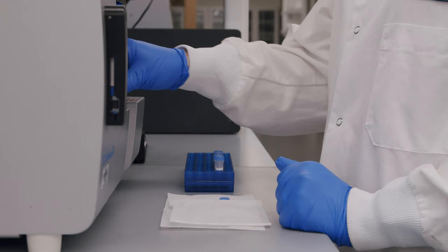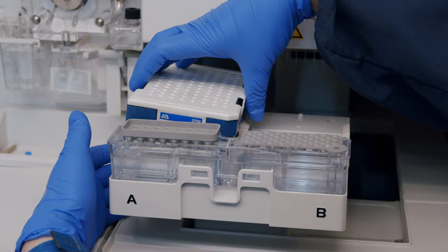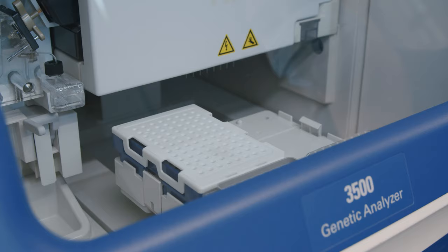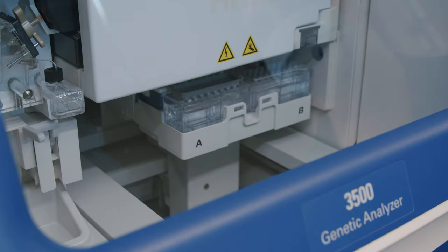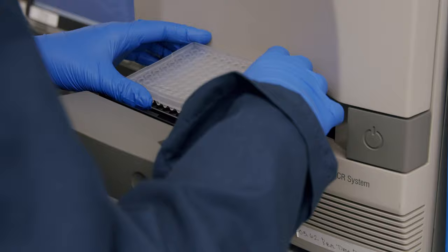After I know how much DNA is in the sample, I use additional chemicals and another instrument that works like a copy machine. It looks at the specific locations that we're interested in as forensic scientists, and makes enough copies of those locations that we're able to view it on a final instrument, which creates or shows us a DNA profile and a picture representation.